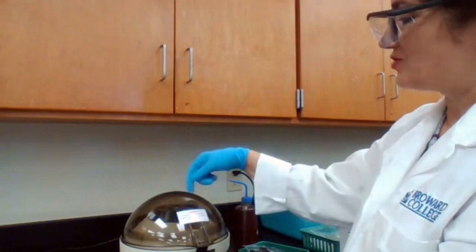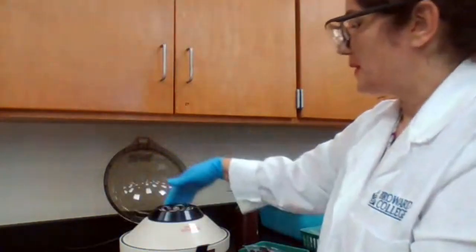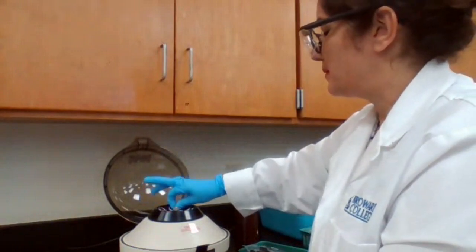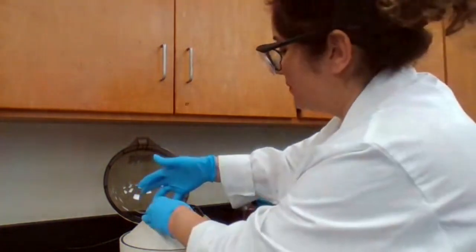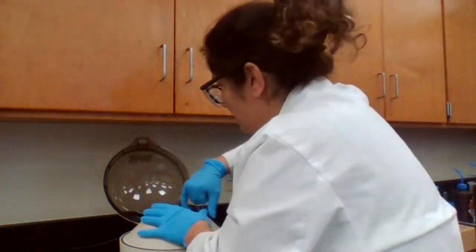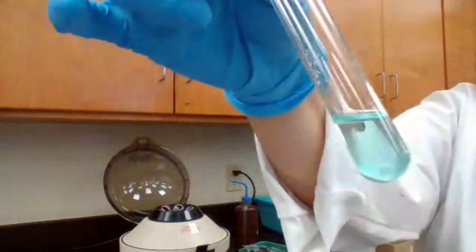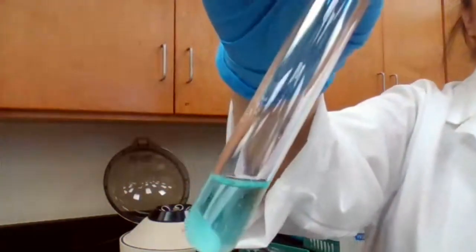So until I can actually see that it's stopped, then I can open it and take my samples out. I've actually had students who have a hard time grabbing this stuff out, but okay. See, it was all mixed up, and now you have a solid and you have a liquid portion.